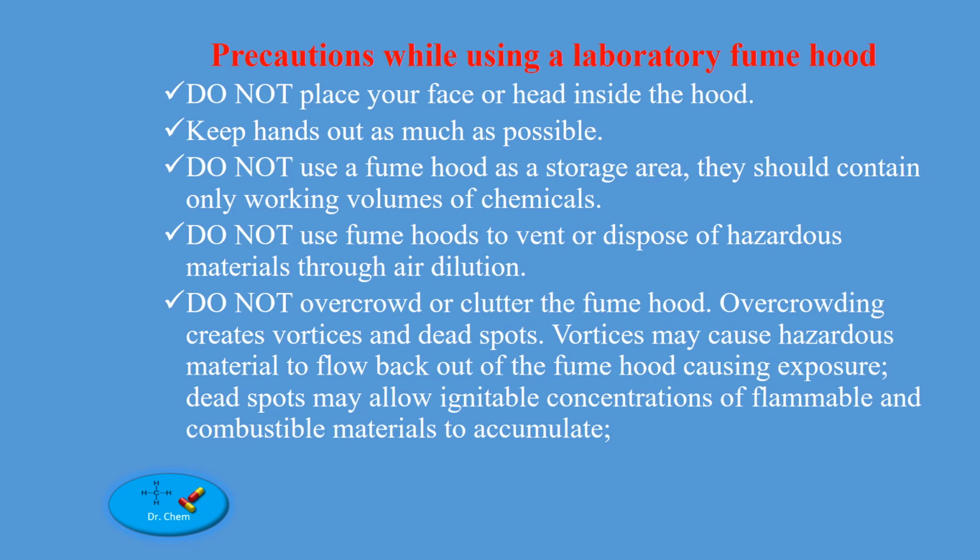Overcrowding creates vortices and dead spots. Vortices may cause hazardous material to flow back out of the fume hood, causing exposure, and the formation of dead spots may allow ignitable concentrations of flammable and combustible material to accumulate, and this may cause fire.